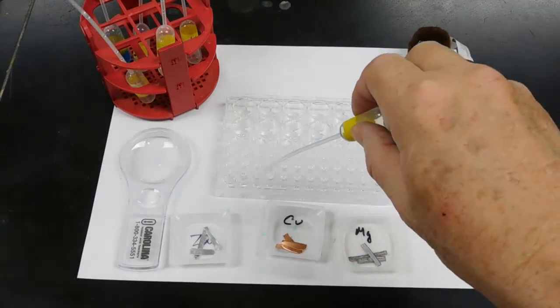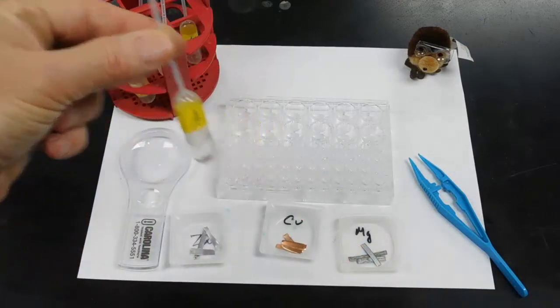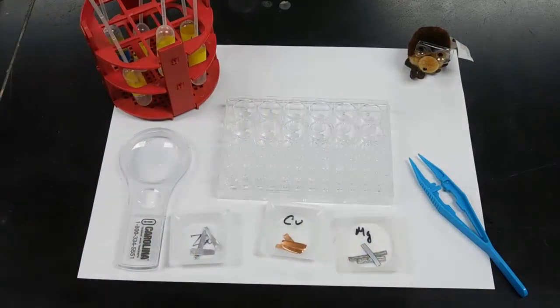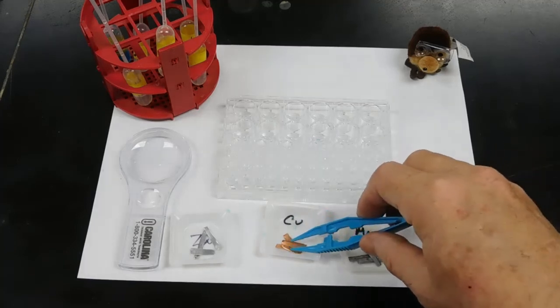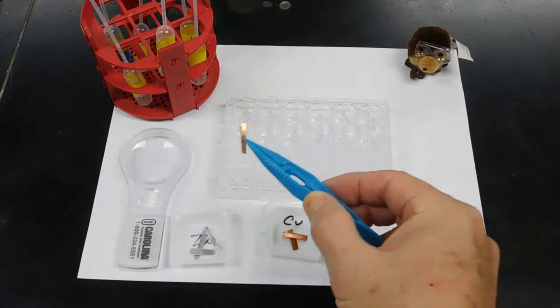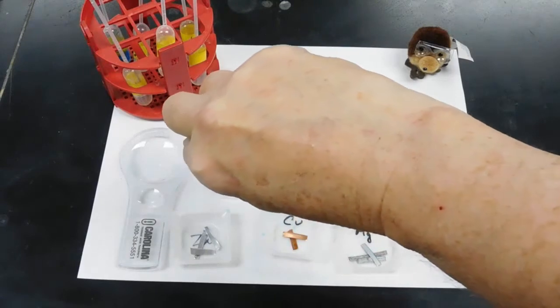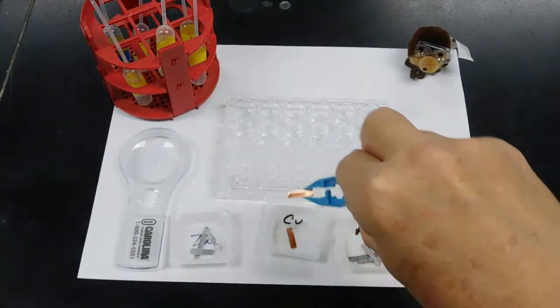Now the pipettes are actually labeled with just the symbol of the element on it. Since all the solutions are nitrates, I felt that we didn't need to put the nitrate and therefore the full formula on, as long as we're working with all nitrates. What I'm going to do next is place a piece of copper metal into each of the 3 well holes. And once I've done that, I'm going to allow them to sit for approximately 5 minutes.